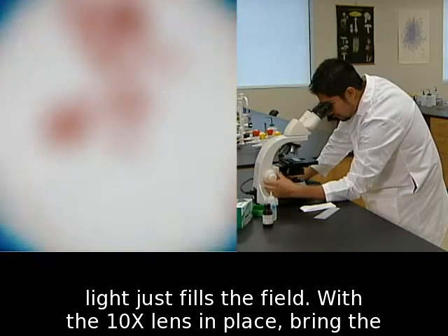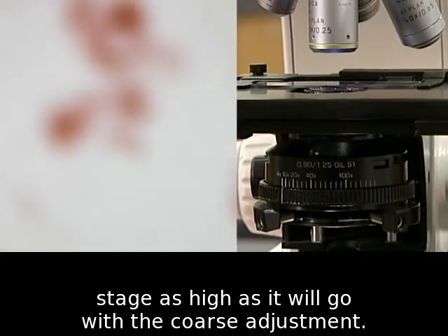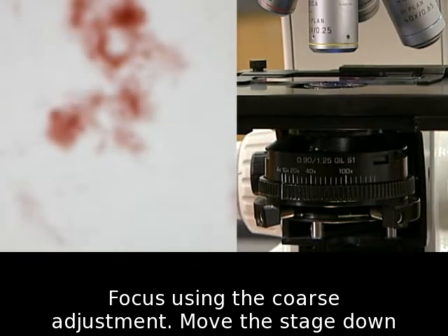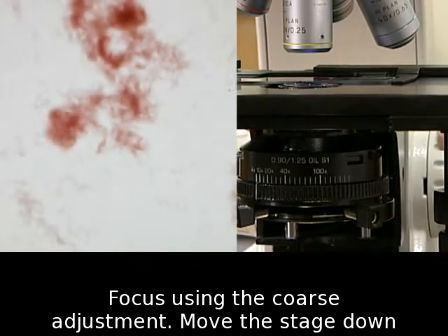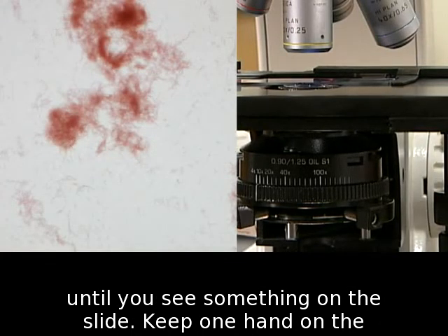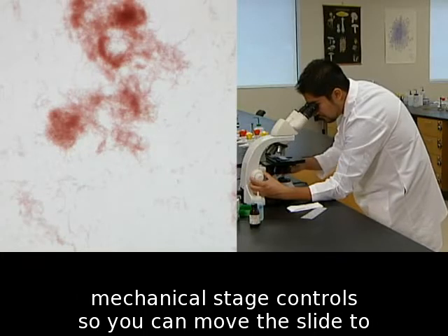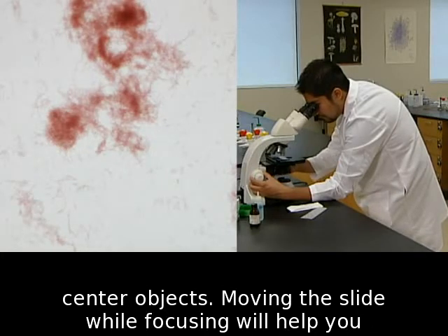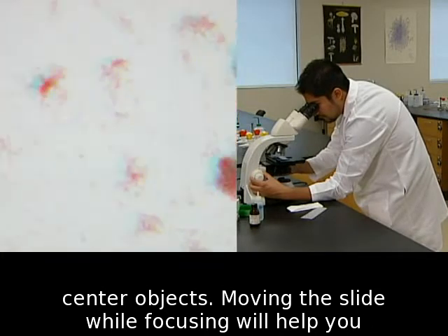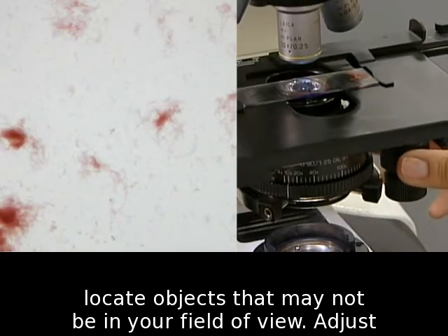With the 10x lens in place, bring the stage as high as it will go with the coarse adjustment. Focus using the coarse adjustment — move the stage down until you see something on the slide. Keep one hand on the mechanical stage controls so you can move the slide to center objects. Moving the slide while focusing will help you locate objects that may not be in your field of view.